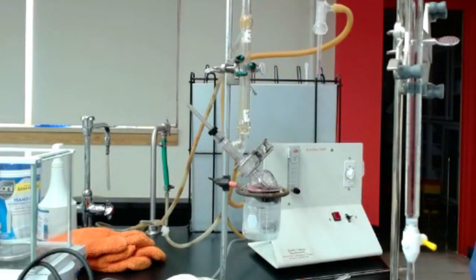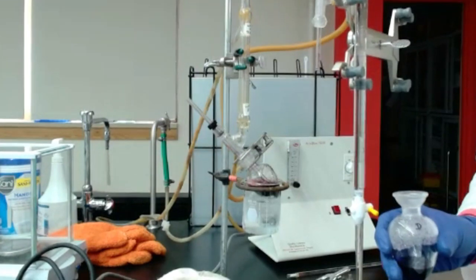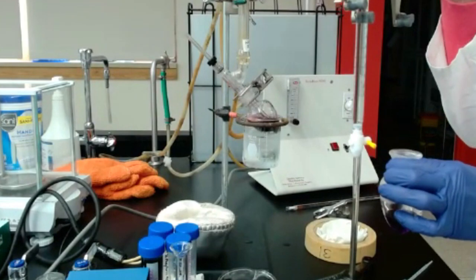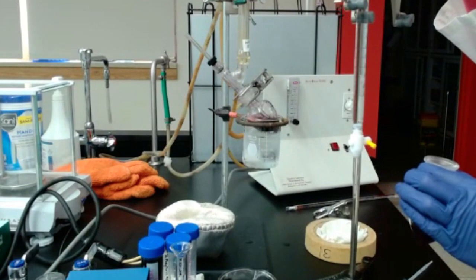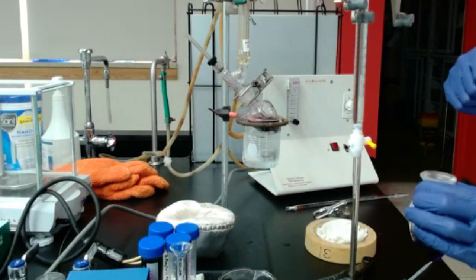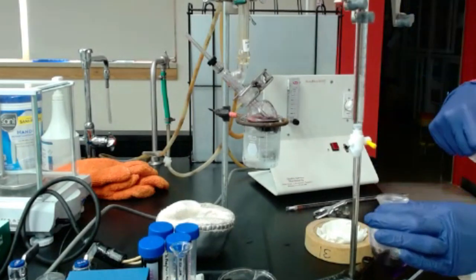And so same as before, I'm just gonna take that flask at the bottom of the burette. But before, I'm gonna record the volume of my burette. And once again, it might have changed, so I want to make sure that's the same. I have 22.6. So I record 22.6. Oh, Alex is recording 22.6.